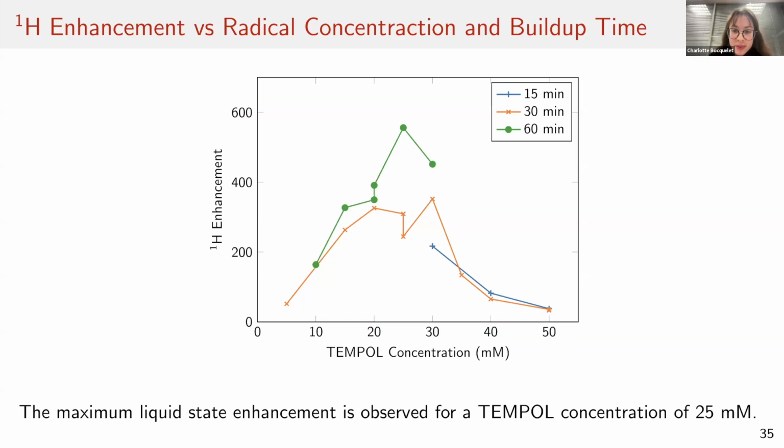Okay. There is a question from Asif too. So Asif didn't quite understand why proton bullet-DNP is more challenging than carbon bullet-DNP. You know, in this reverse INEPT project that you showed, why did you require the reverse INEPT, and why not directly hyperpolarized proton?